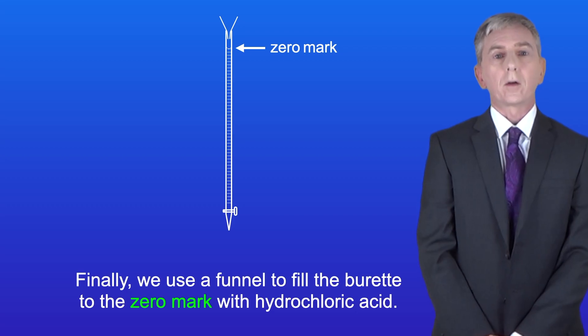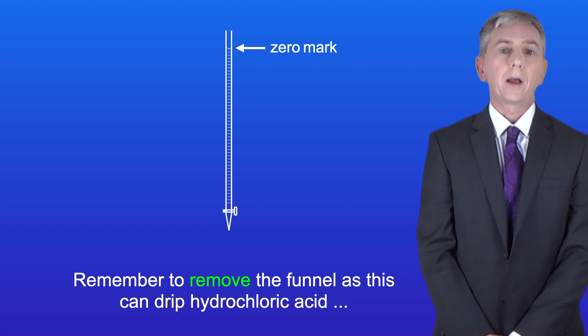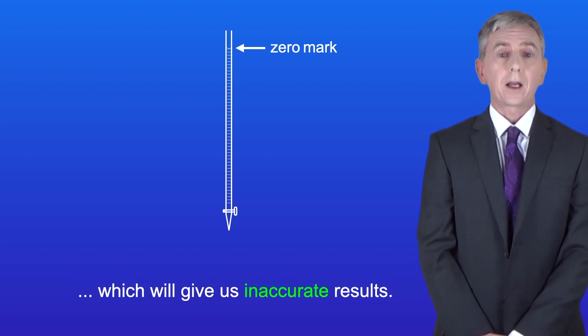Finally, we use a funnel to fill the burette to the zero mark with hydrochloric acid. And remember to remove the funnel as this can drip hydrochloric acid, which will give us inaccurate results.